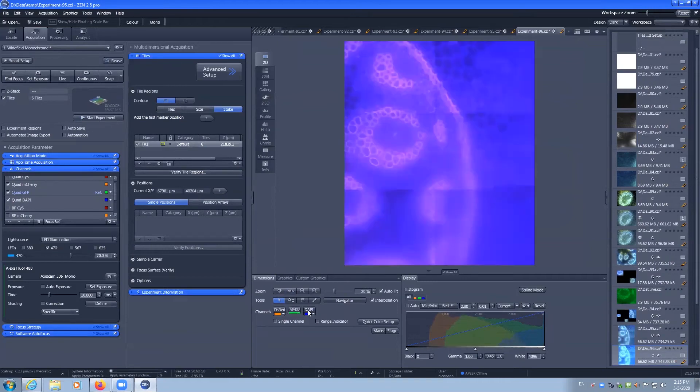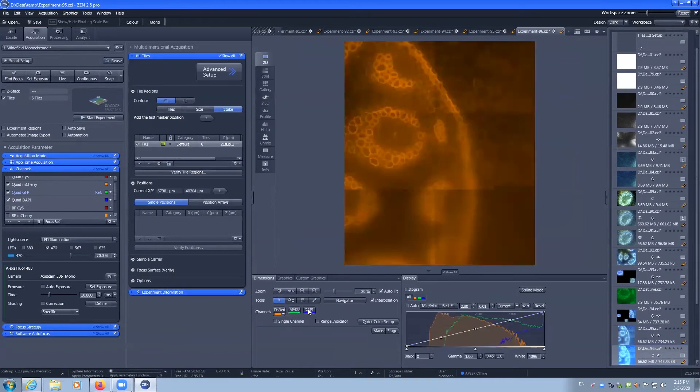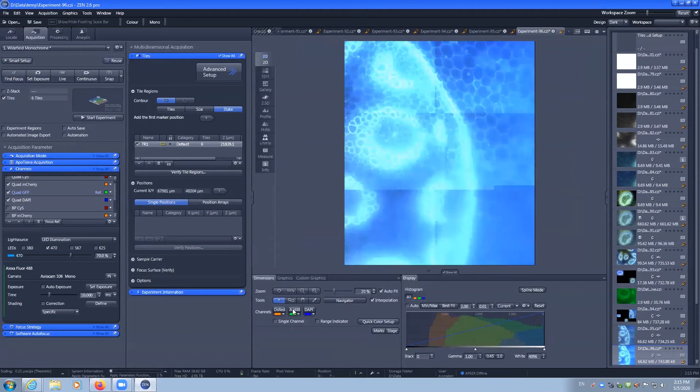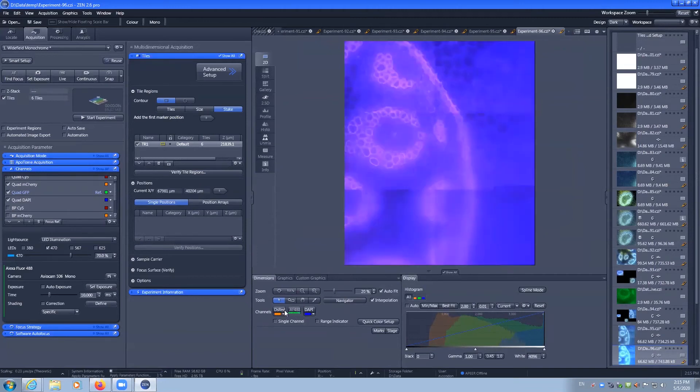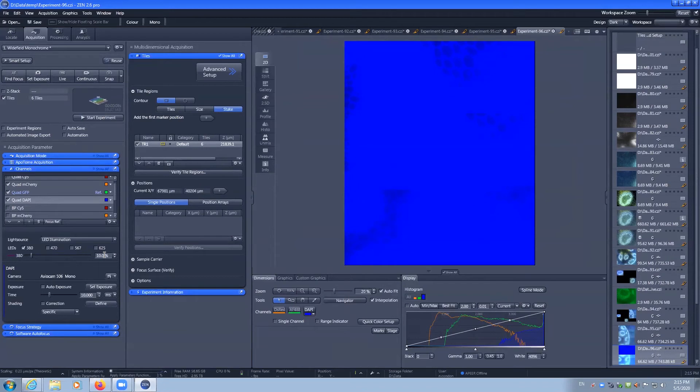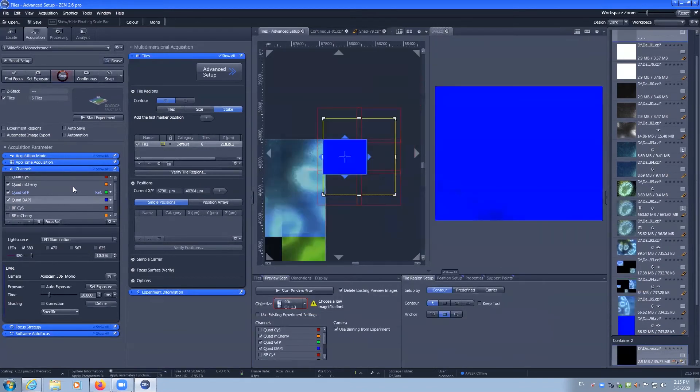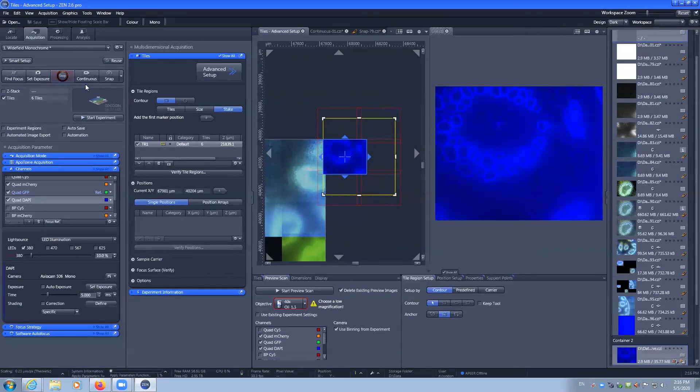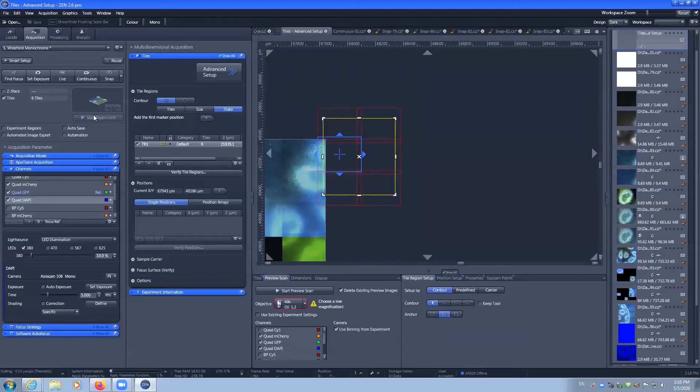I can also then have a look at my individual channels. I can toggle them on and off as needed. You can see that the DAPI is saturating. Perhaps we need to lower our settings for DAPI. Recapture that.